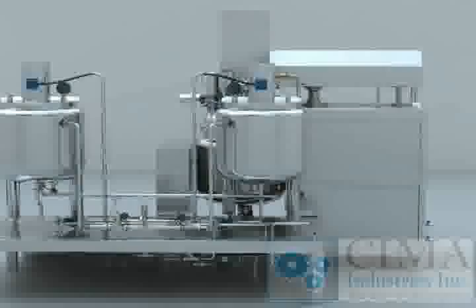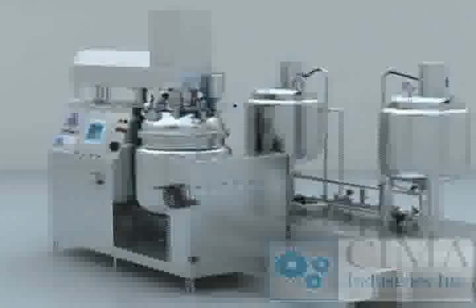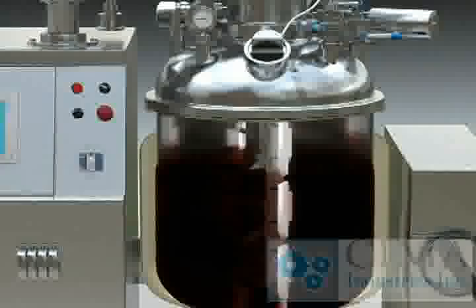The TFZR Vacuum Emulsifier is especially designed to adopt advanced technology from overseas according to cosmetic and ointment production technology. It is used to produce cream products in cosmetic and medicine factories, especially for emulsification of peptic material with high content of solids. The machine features easy operation, steady capability, good homogeneity, high efficiency, solid structure, small volume, high automation level, and easy cleaning.